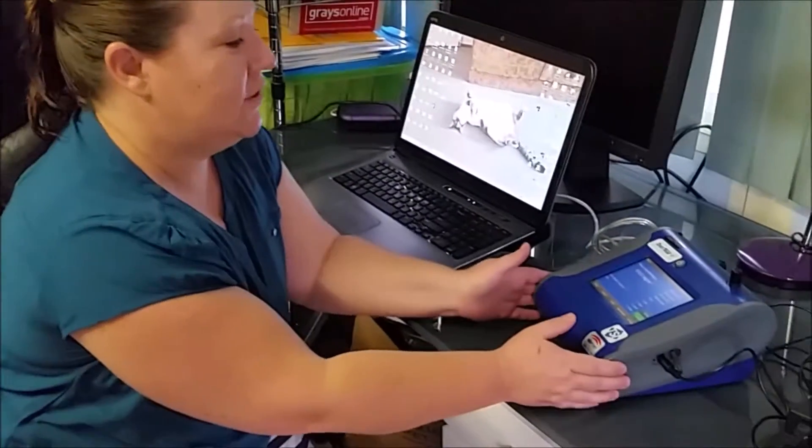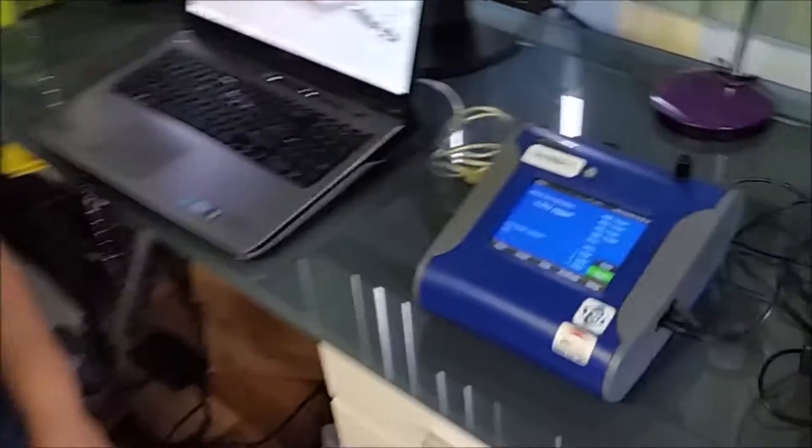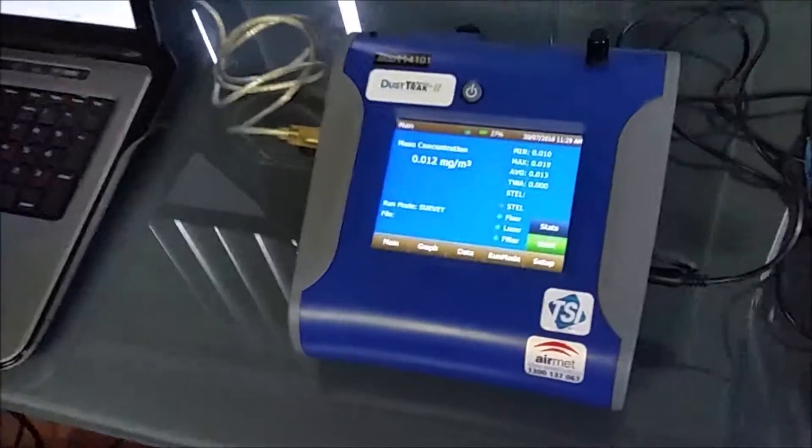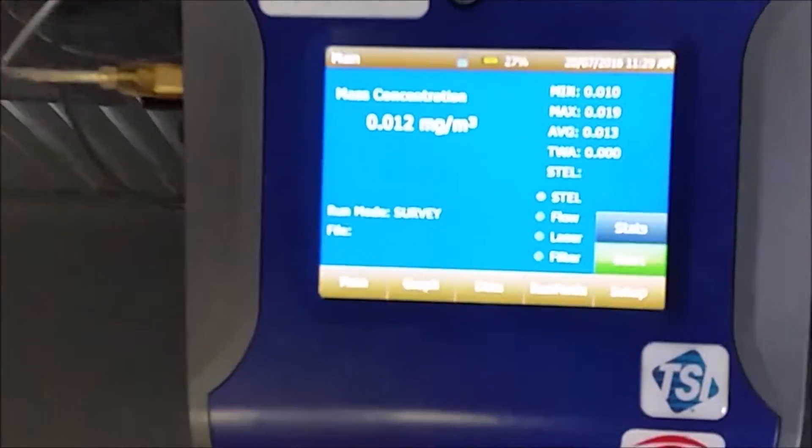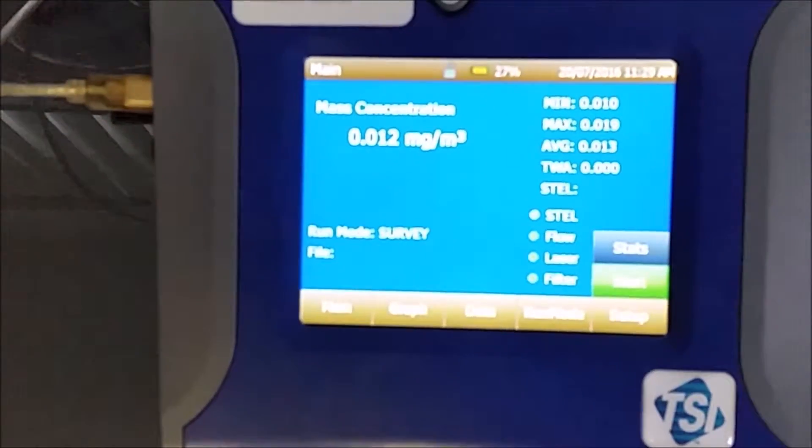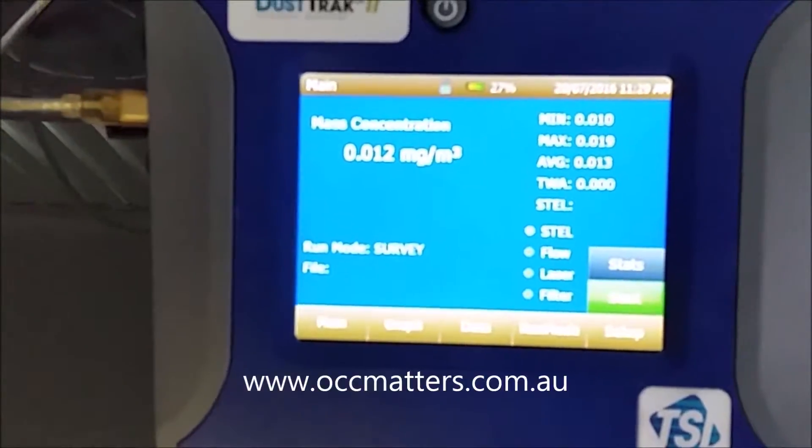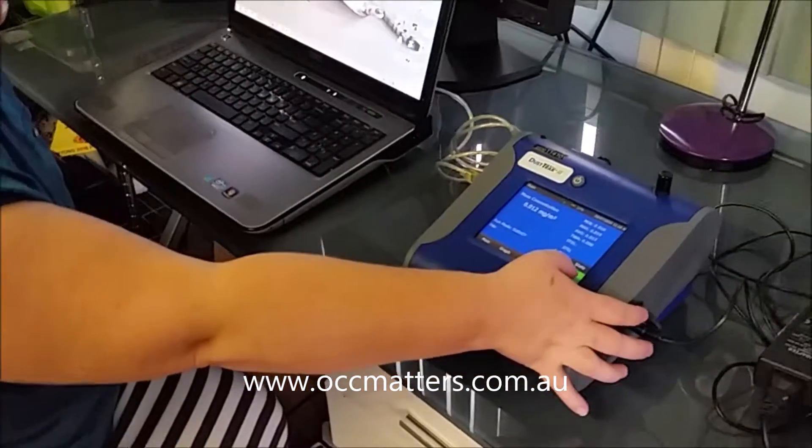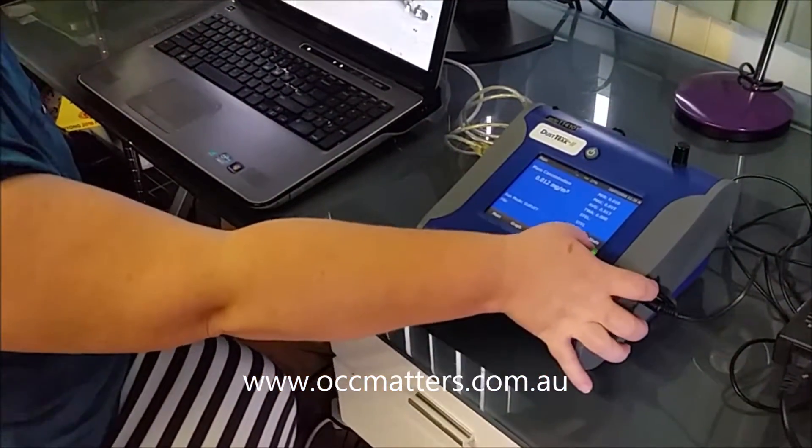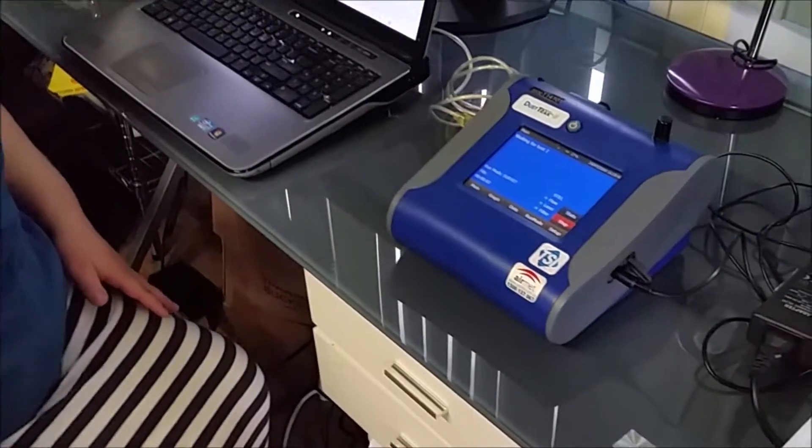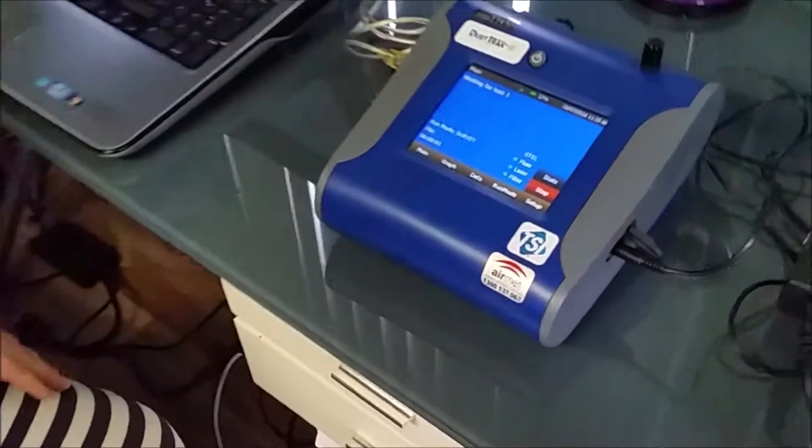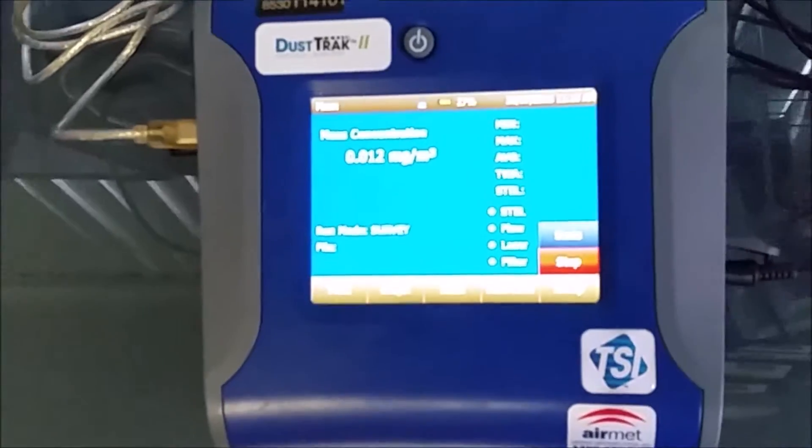So this is the dust track. It will show you at the moment it's in the survey mode. It has a start button, which I'll start for you. So it's warming up at the moment.